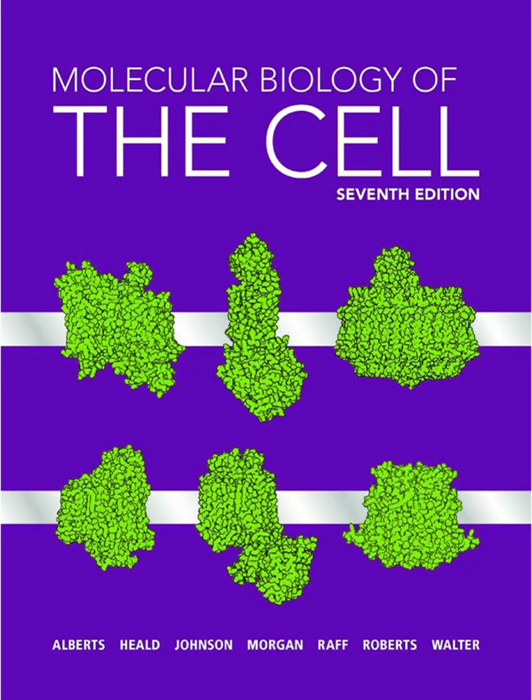It's pretty exciting. So speaking of conventional light microscopes, they hit this fundamental wall for over a century. The diffraction limit. It's tied to the very nature of light itself. Visible light behaves like a wave, right? It has a wavelength between about 0.4 and 0.7 micrometers. And you just can't resolve two objects that are closer together than about half the wavelength of the light you're using. So around 0.2 micrometers, or 200 nanometers, roughly. Exactly. That's the theoretical limit for conventional light microscopy. So fine details inside bacteria or the internal folds of mitochondria just blur together.